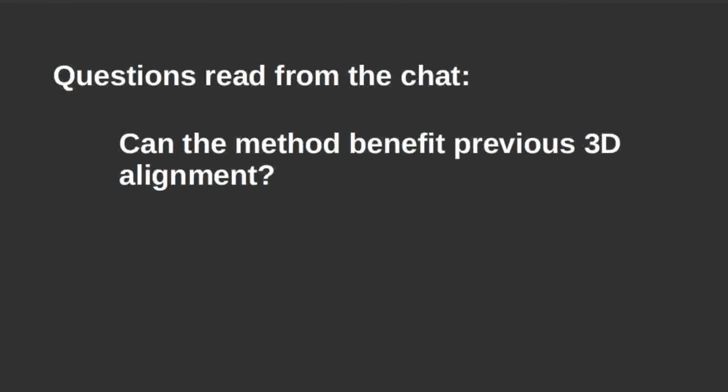Because we were testing this for HEMNMA, so single particle analysis. Previous alignment, we didn't test this. My feeling was that it would have been better not to align images, at least not to move them.